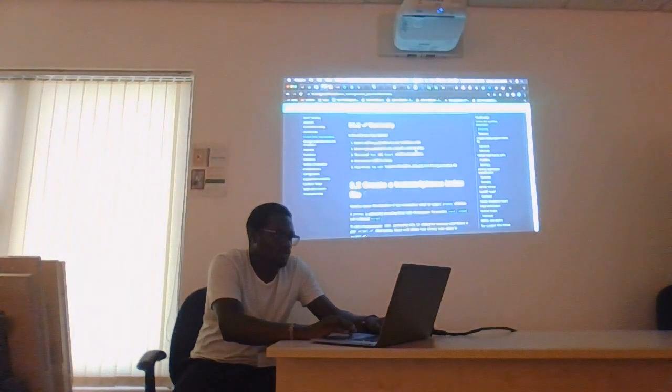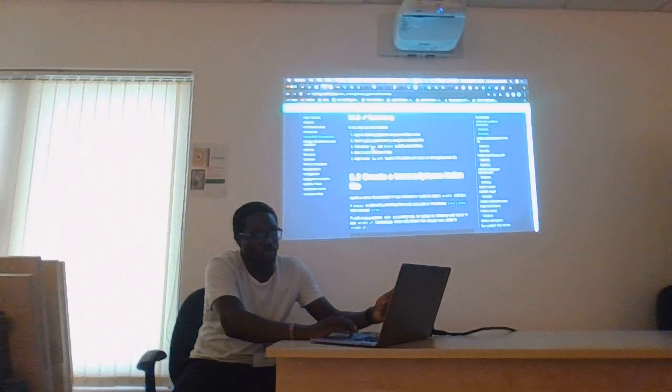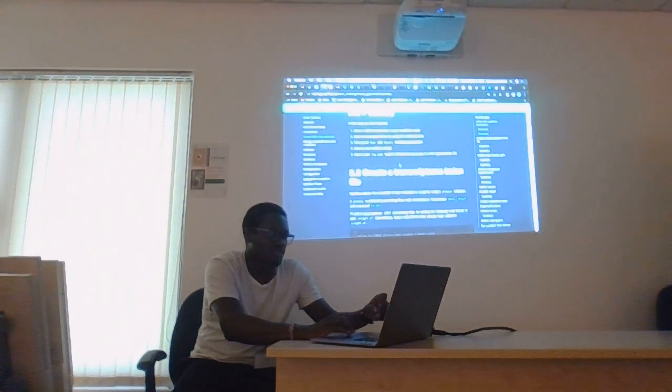Okay, so you can still use a placeholder. As I said, the syntax for a variable follows that of shells, so you can use the $ and the variable name, or the $ with curly braces in placeholders. Okay.